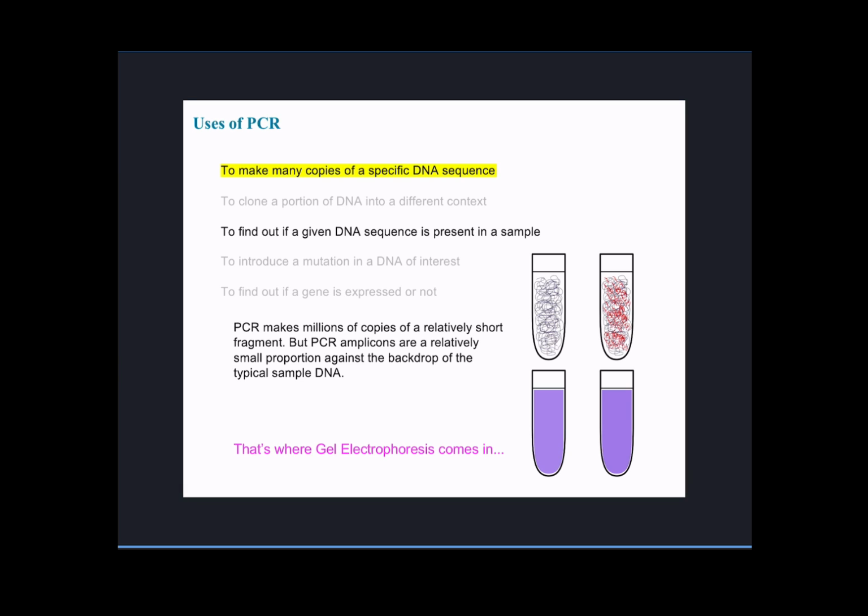That always presented a problem, and part of the solution actually, in a way, preceded the use of PCR, but the solution came to mind really quickly for people who work with DNA in labs at the time that PCR was invented. And that is, what we know about these PCR fragments is that they should be of a specific size. And now we go to what you were suggesting before. If we could take a look at whether or not we have many copies of DNA pieces that are of that specific size that we anticipate, then we can more confidently determine if the PCR worked or not.